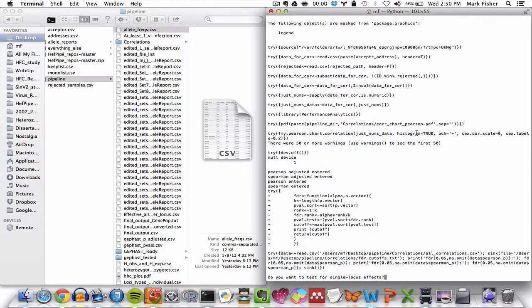So you have one model that has lots of different response variables representing each locus, and another model with one response variable that's a composite of all of the other loci.